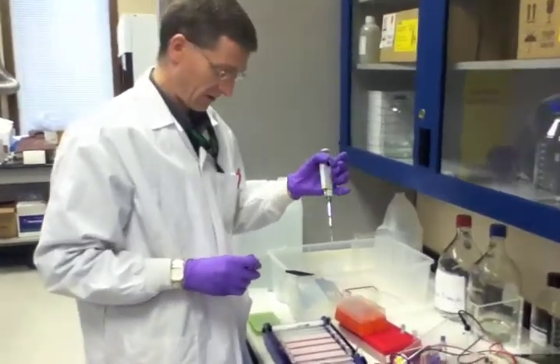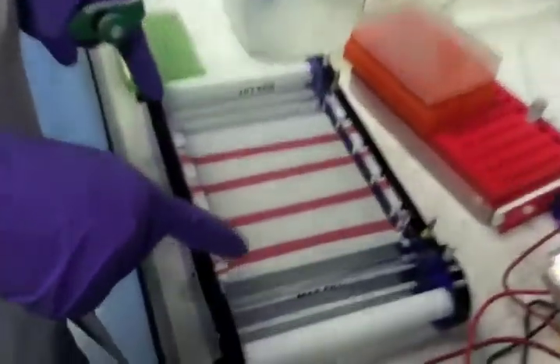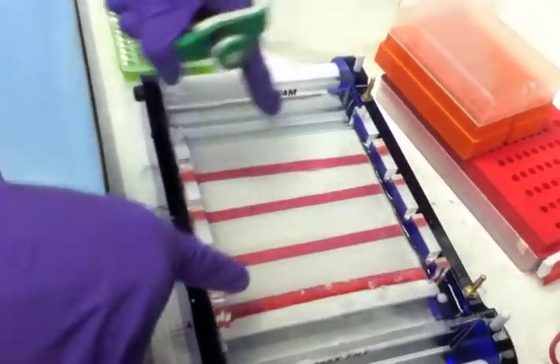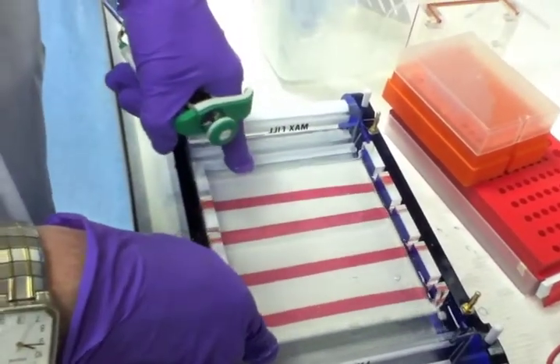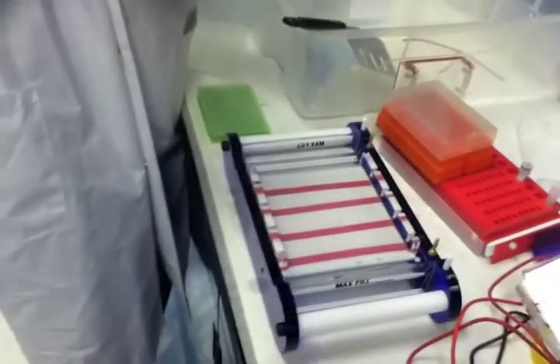It's not going. Okay, so we're going to load your samples now. And I have already poured a gel, a cast of gel here. This is an agarose gel. And it's just like pouring jello in a mold. And if you look carefully in the film, you can see some holes in the gel, and those are the wells that we're going to pour our DNA into, just like we saw in class.